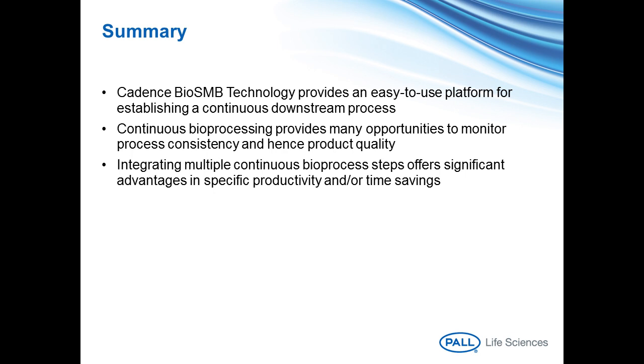So it doesn't really require any process variables, and I can look at any trace, whether it is a transition in conductivity or a transition in pH, and it's just a matter of what I am looking for. If I see huge differences in principal components between different columns, then I might also look at conductivity transitions, because that tells me a lot about the packing density and the packing consistency between different columns. So it's not so much a guided process through process variables. It's much more a tool that we can use for root cause analysis should anything behave differently than you thought it would.